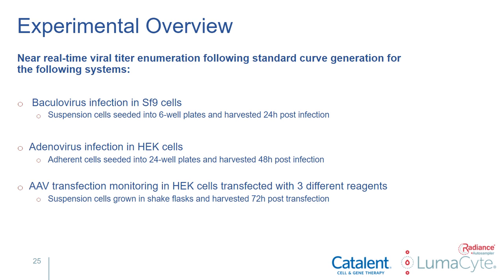harvested 48 hours post-infection. And the final experiment was the AAV transfection monitoring that we did in HEK293 cells, where we transfected using 3 different commercially available transfection reagents. And this was done in suspension cultures, which were then harvested 72 hours post-transfection for the Radiance measurements.